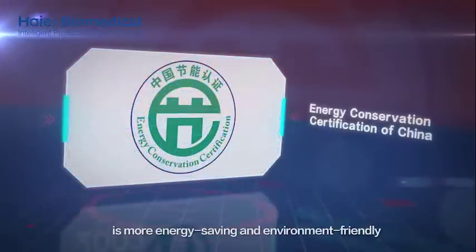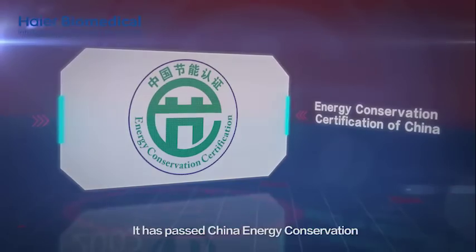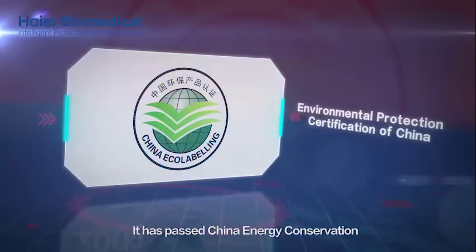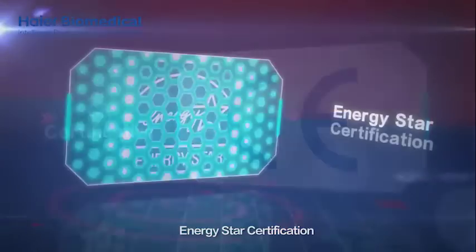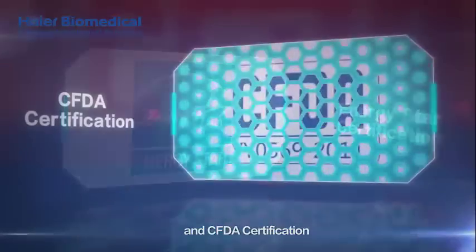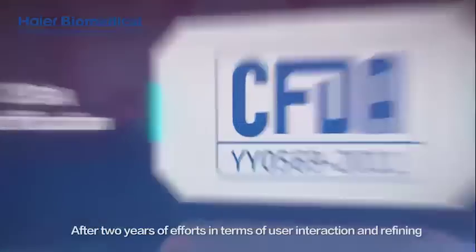It has passed China Energy Conservation and Environmental Protection Certification, CE Certification, Energy Star Certification, and CFDA Certification.